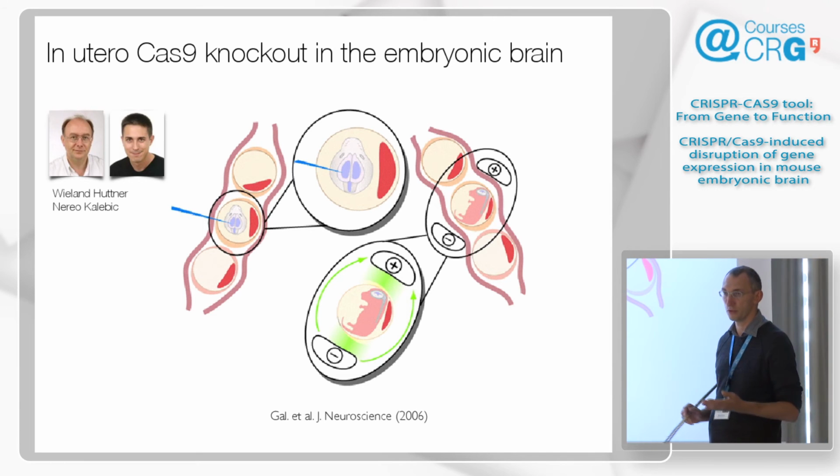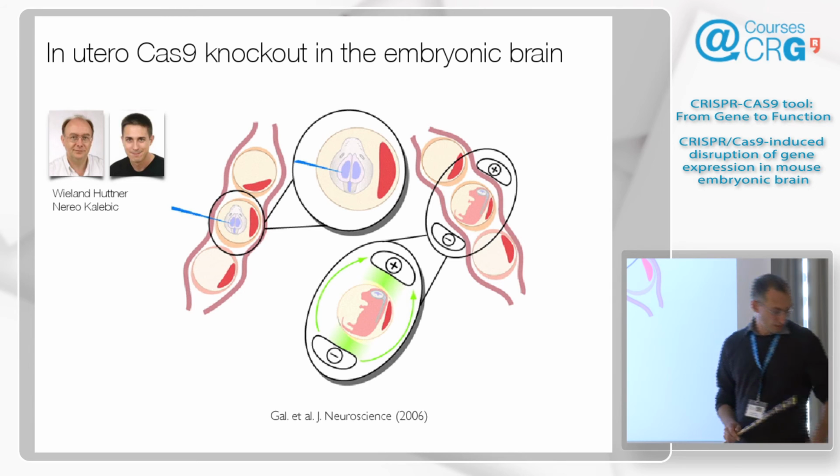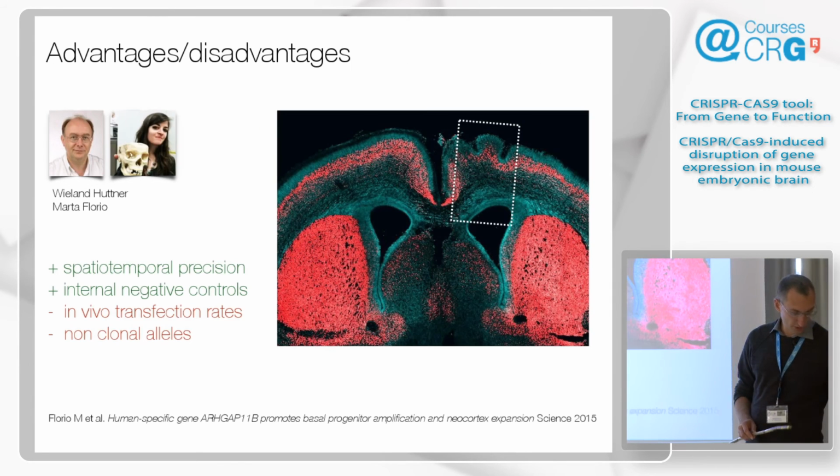And whatever molecule you put there, whether that would be siRNA or a plasmid, will end up migrating towards the electrode. And then by the way you orient it, you could send your reagent in different parts of the brain. And so this is very popular in neuroscience.